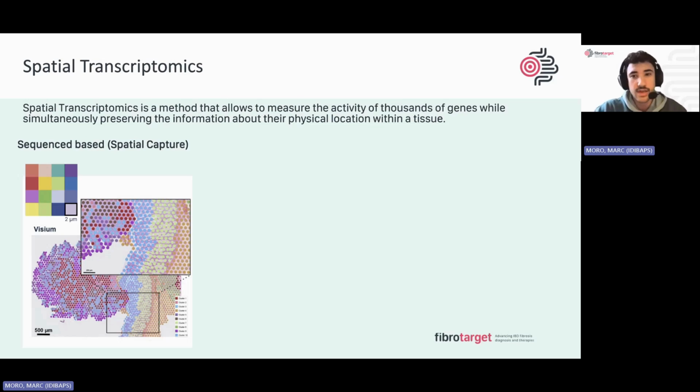So this approach enables us to capture the whole genome across the entire tissue slide. However, because we are working at the square level, many RNA molecules are basically ligated into a single point, providing a high density snapshot of that specific spatial location.